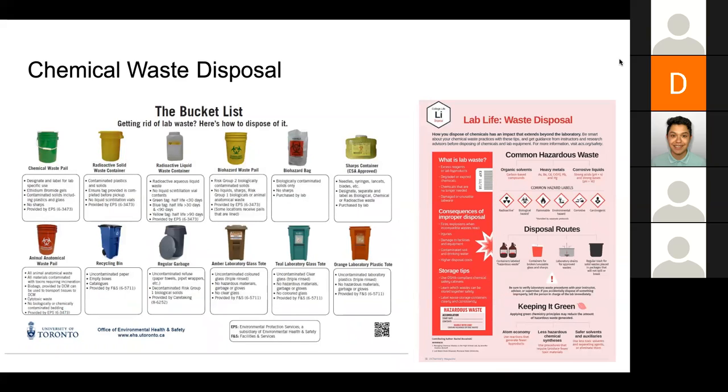Another important way to protect yourself is through proper chemical waste disposal. Obviously, there's a very long list of chemicals I'm not going to go through again, but they're all toxic. That we all know. So just make sure that before you're throwing anything away, it has been properly neutralized and won't present a threat to anybody. And then make sure, like this list shows, to put it in the correct bucket or container so that it can be disposed of safely and properly. And if there's ever any doubt, reach out to your TA, because they will know and they will be able to help you.